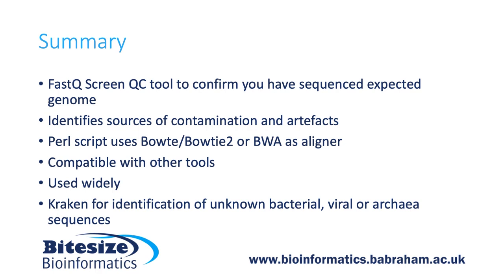So to summarise, FastQ Screen was a tool developed in the Bioinformatics department at the Babraham Institute, and it's used to QC next generation sequencing data. It's a very quick and easy way to make sure that the reads you're getting out of the sequencer do indeed map to your expected genome. So if your reads aren't mapping to your expected reference genome, what you should also pass to FastQ Screen is a list of genomes which are likely sources of contamination. FastQ Screen will then map your reads against these likely sources of contamination and tell you if there is contamination and what the likely source is.